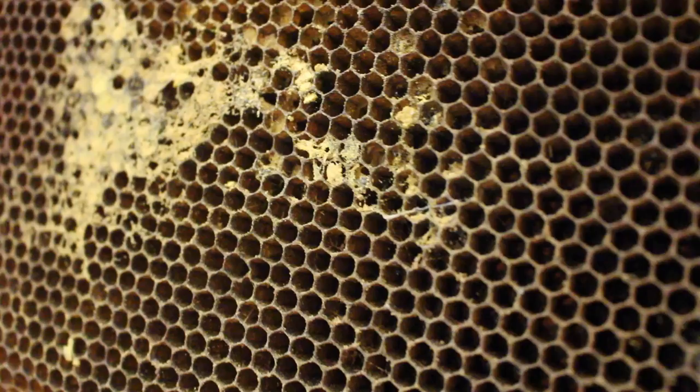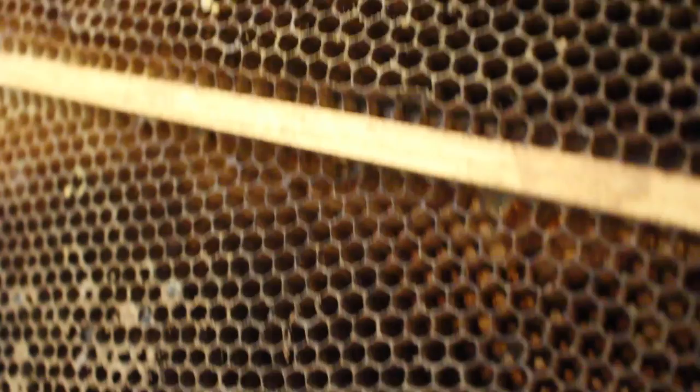In the wild, bees make their own wax to create this wax comb — all of these little hexagonal cells that connect together — and they have two jobs. The first is to store honey, and that happens here at the top of the wax comb, but then if we move down here, the same cells are used to raise the brood. That's the baby bees.